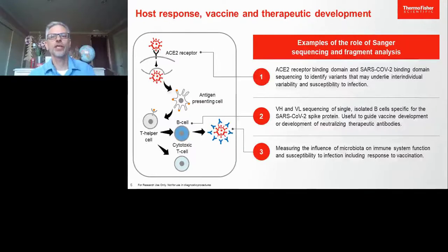And as we'll see in the next few slides, a fragment analysis-based CE approach can provide a rapid, cost-effective approach to profiling microbiota in the gut and the airways.